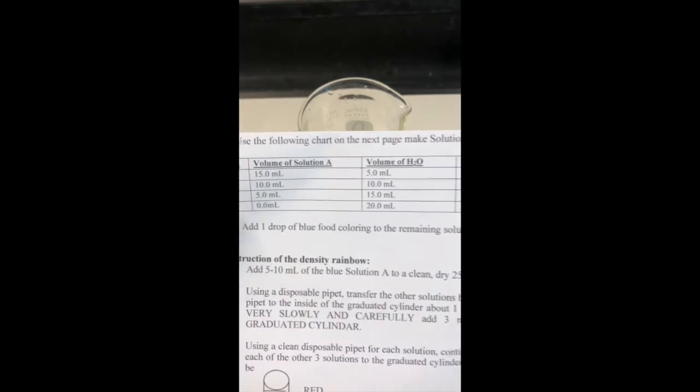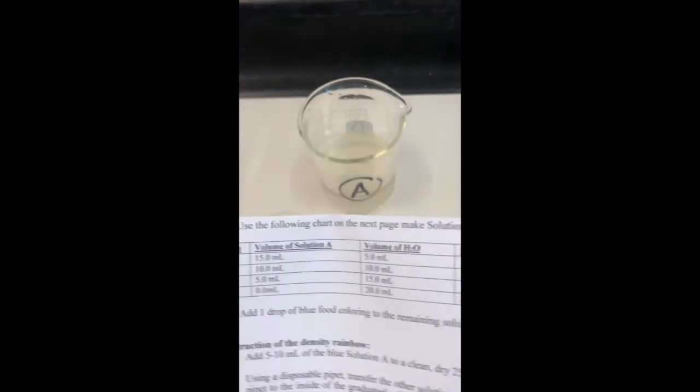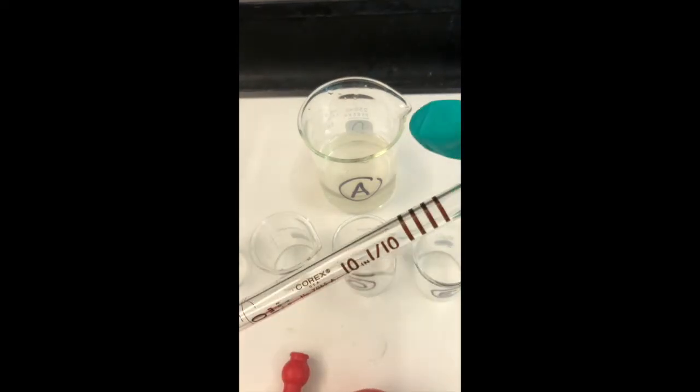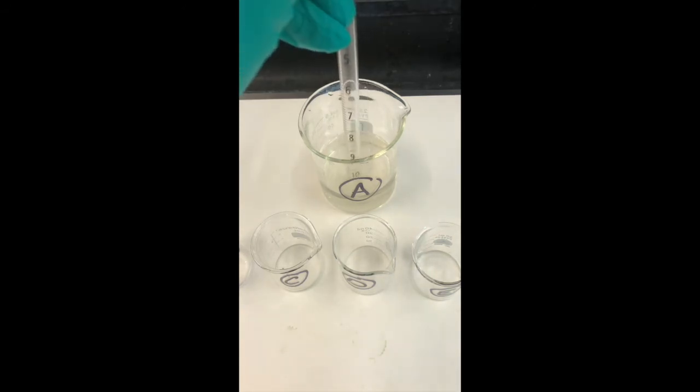And using the chart in our lab, which I'll show you right here, which you can see, solution A, water, and drops of food coloring. So we're going to be preparing the components of our rainbow. So in pre-labeled 50 milliliter beakers, we're going to use a graduated pipette to administer these volumes of solution. Obviously for E, we're just going to leave out our stock solution. Okay, so we're going to use our graduated 10 milliliter pipette, and you'll begin preparing each solution.